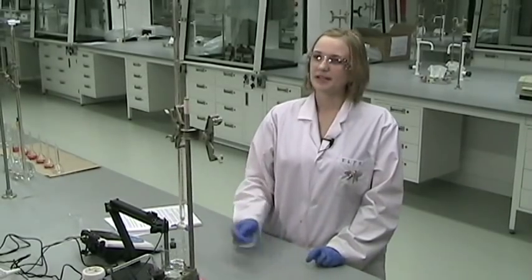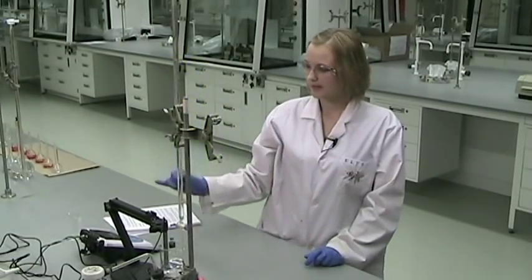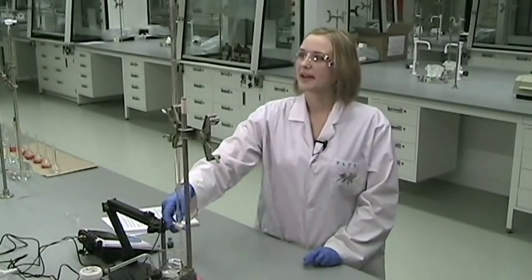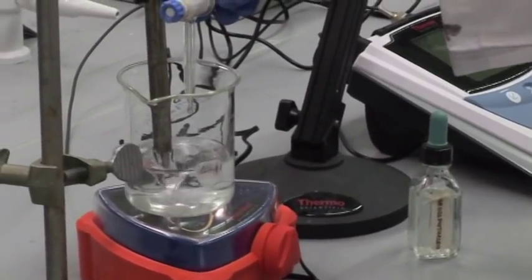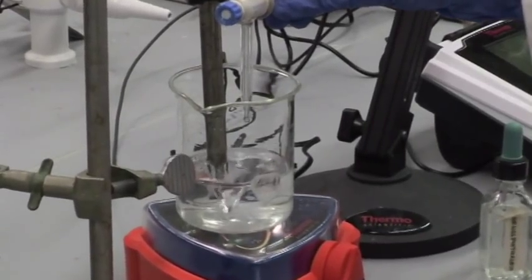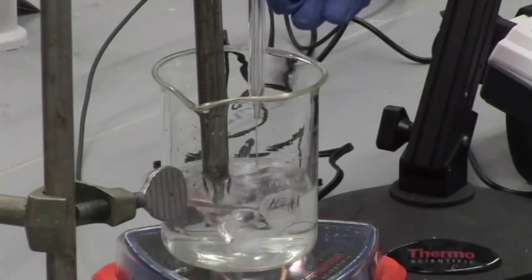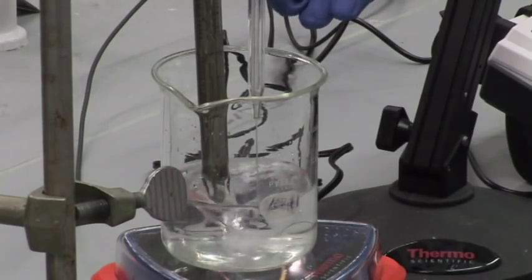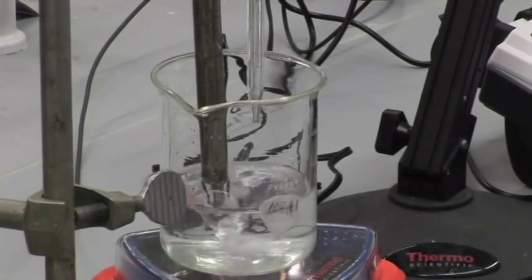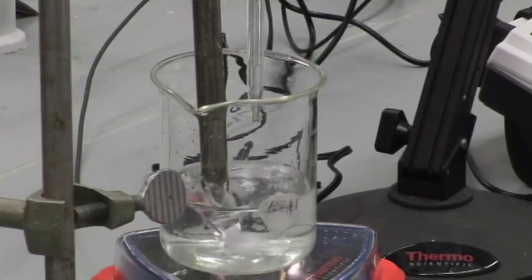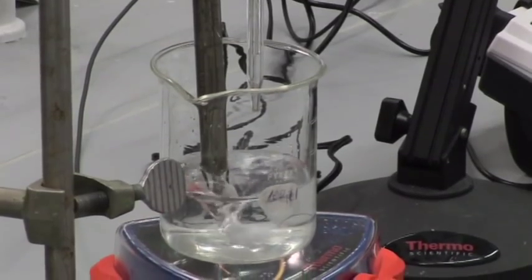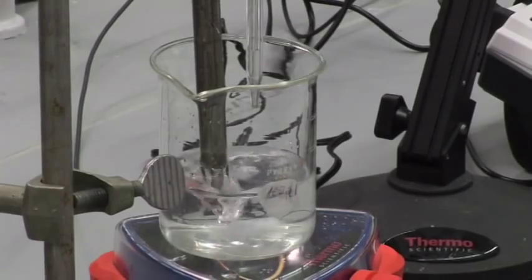So when I'm ready to begin, and I have my initial volume and initial pH recorded, I will start by adding about two mils of base to the acid solution. Now, you want to plot many points along the curve, and you want to be able to see the shape of the curve before there's a steep increase in pH.